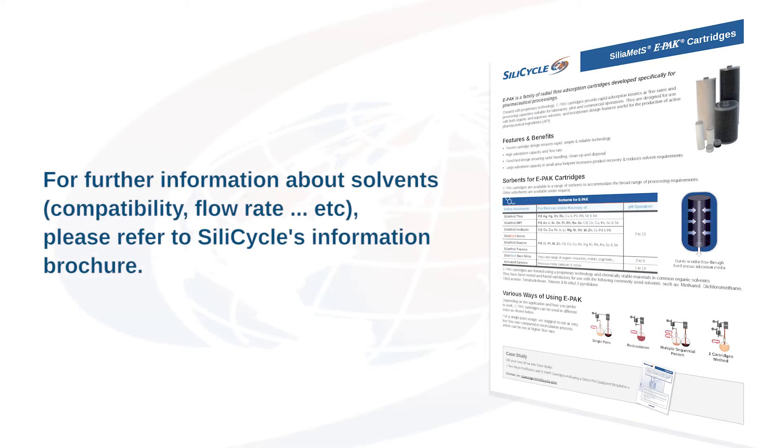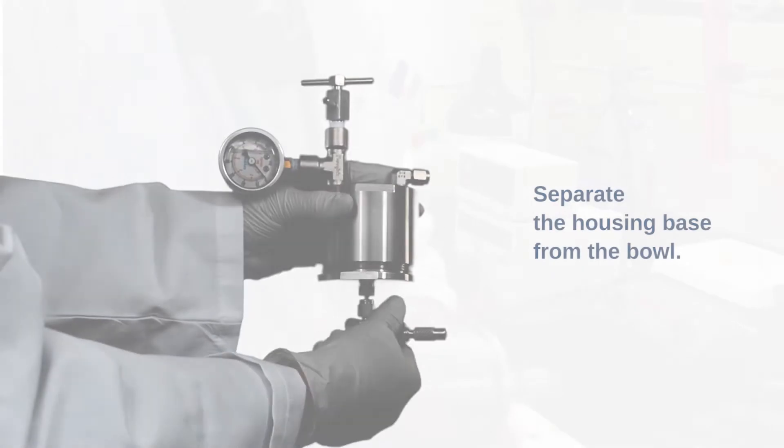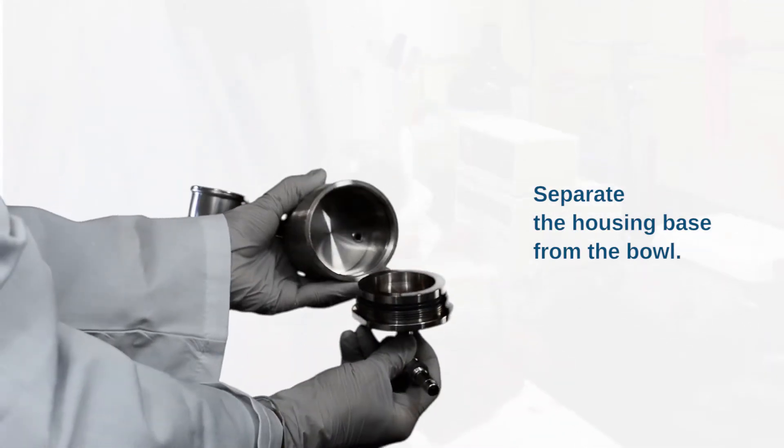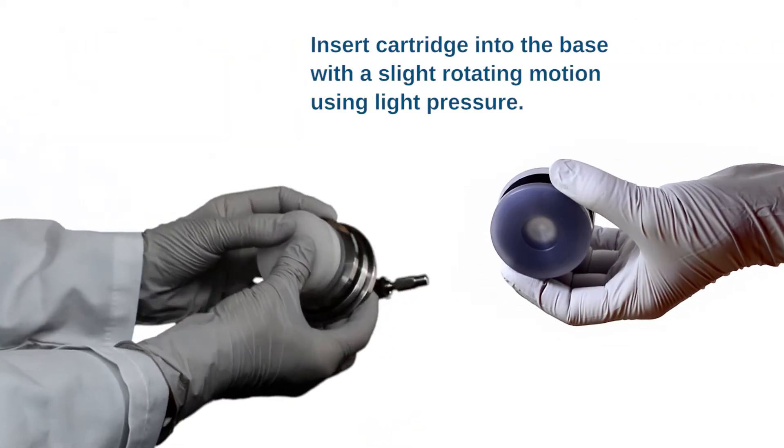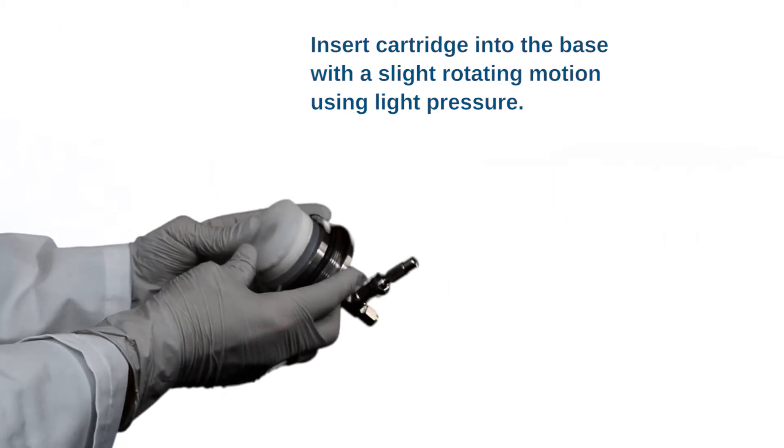For further information about solvents, please refer to SiliCycle information brochure. Separate the housing base from the bowl. Select a cartridge.